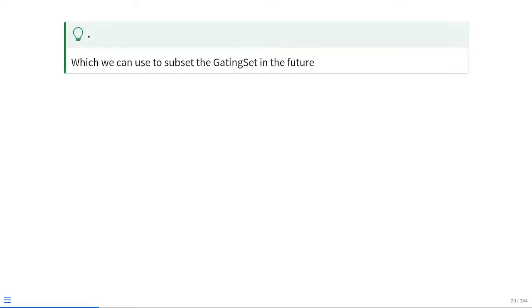All right. Now, why do we do all this? It's mainly because it will allow us to subset out files based on particular metadata conditions that we're interested in. So right now we only have 6 files, but if we had 140 FCS files and we only wanted those that were treated with SEB within the gating set, having that column within metadata would be useful.